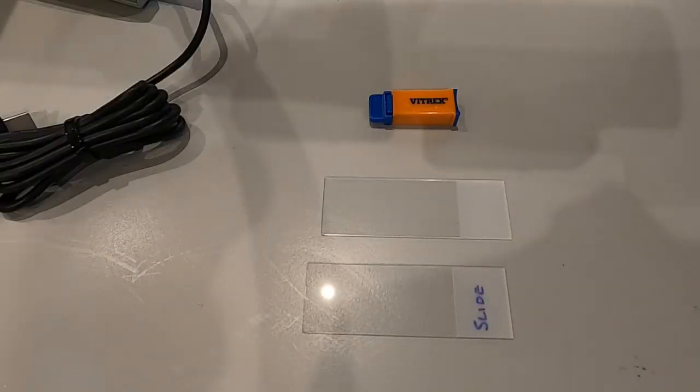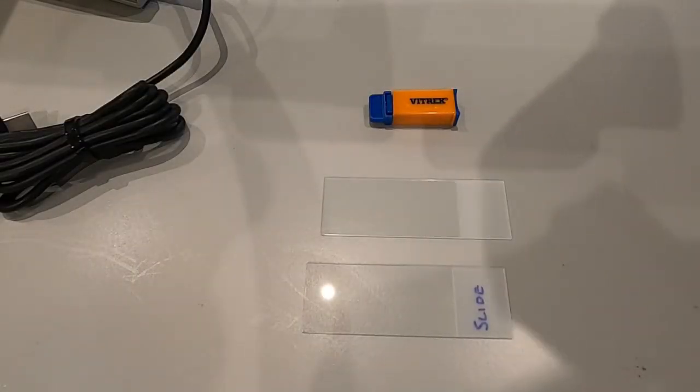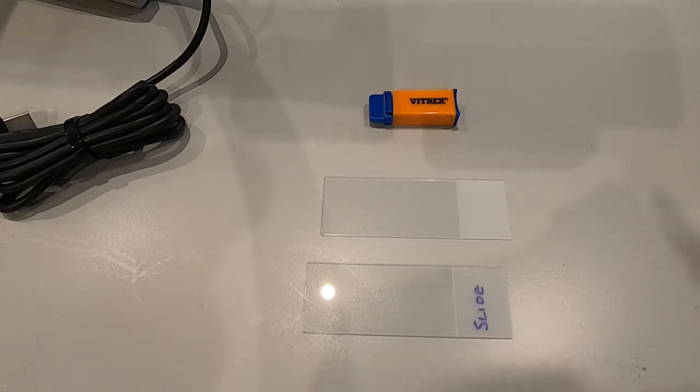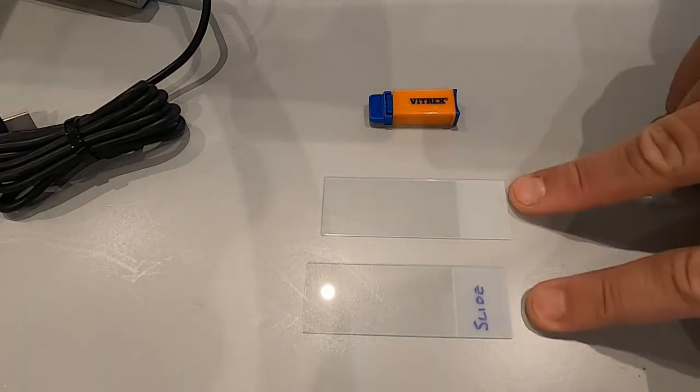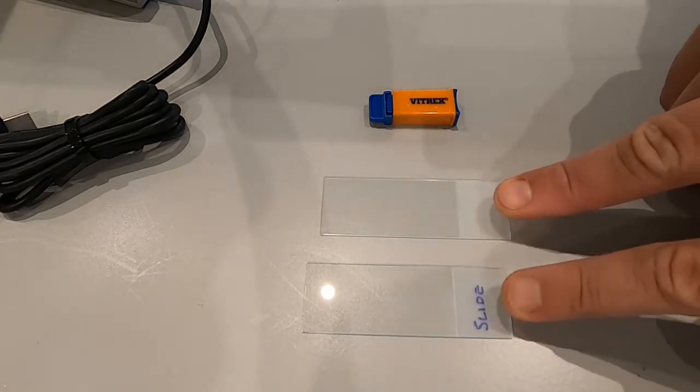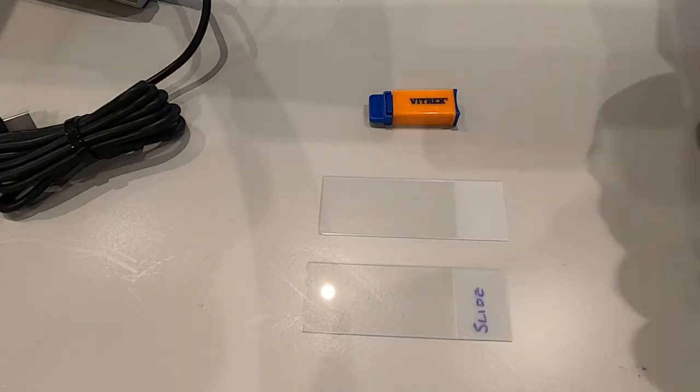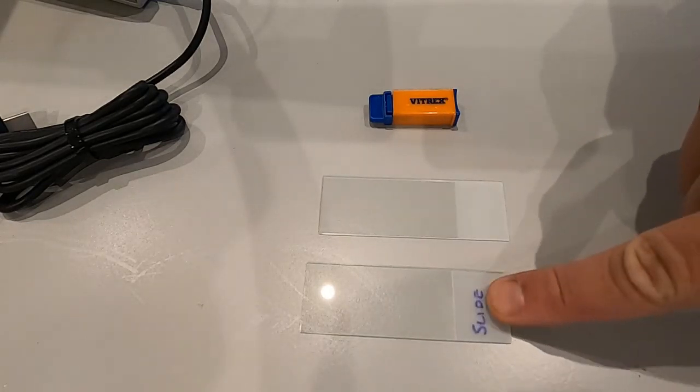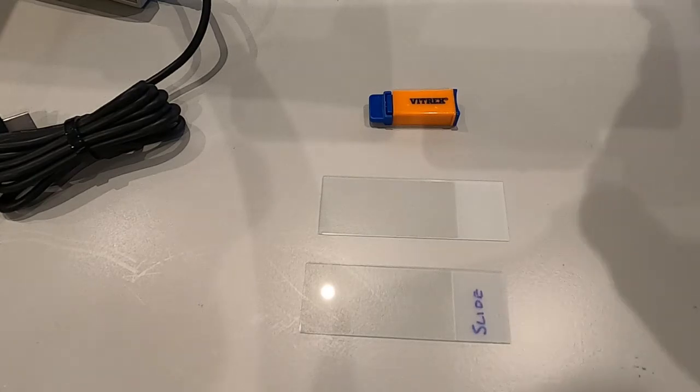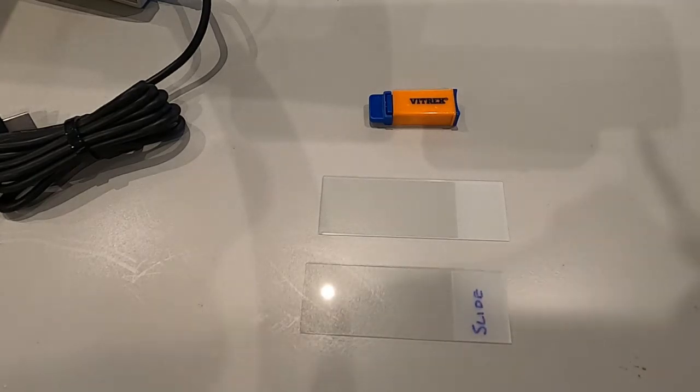For this practical you'll need very basic equipment: two glass slides, one of which I've labeled, and that will be the one I'm going to use.